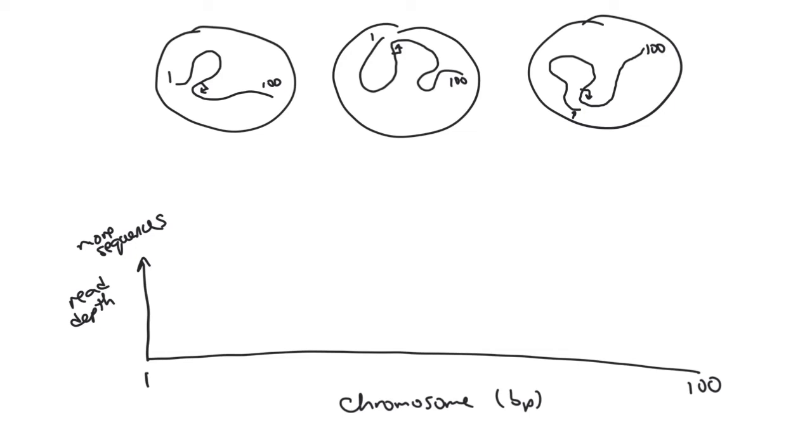So in this case, for example, in any of the 3 techniques we've discussed, will we see any sequence of chromosome or nucleotide 100? Well, it's not in euchromatin because it's not a gene and it's not a promoter or an enhancer. So it will be in heterochromatin most likely, so we shouldn't see much sequence from it.